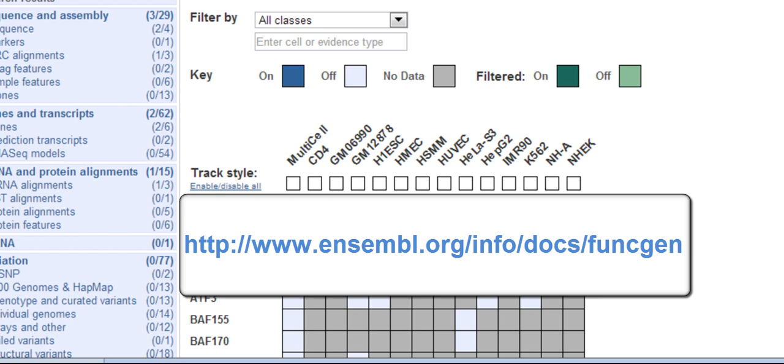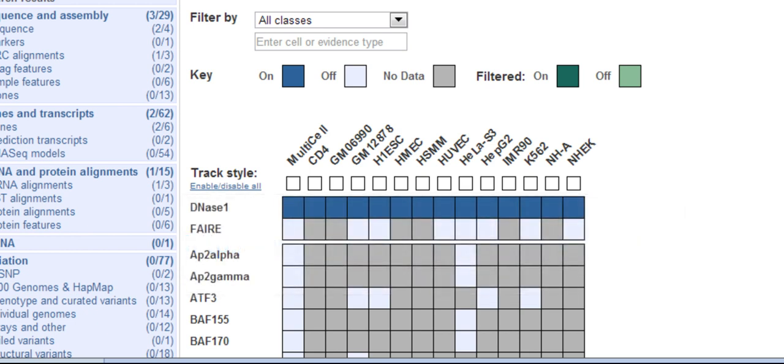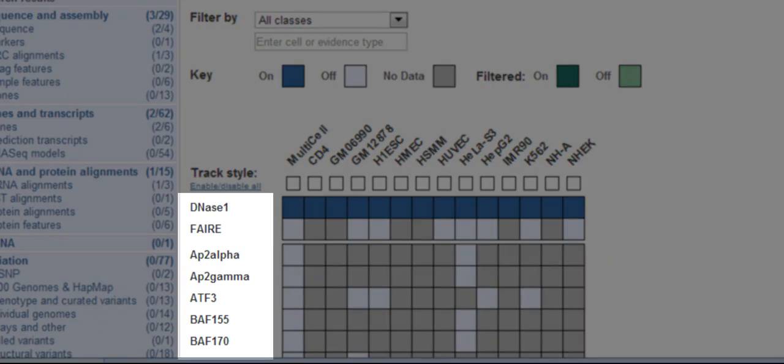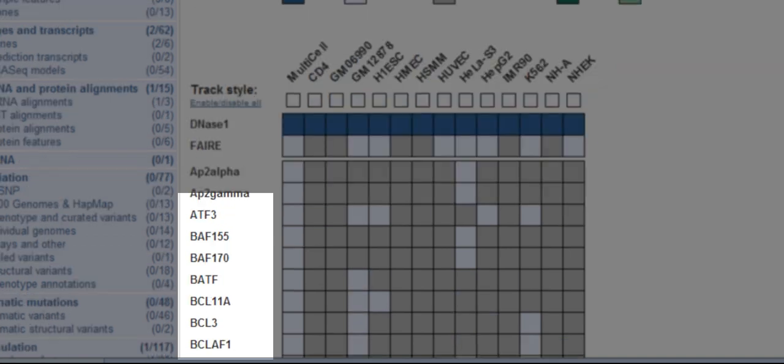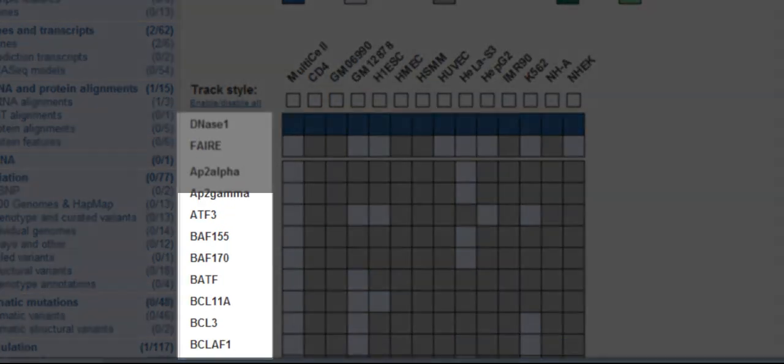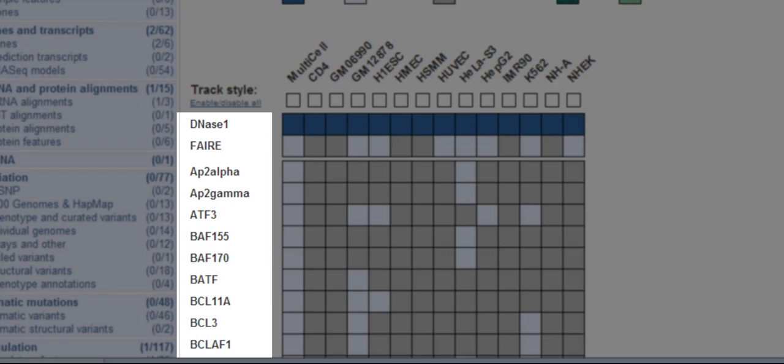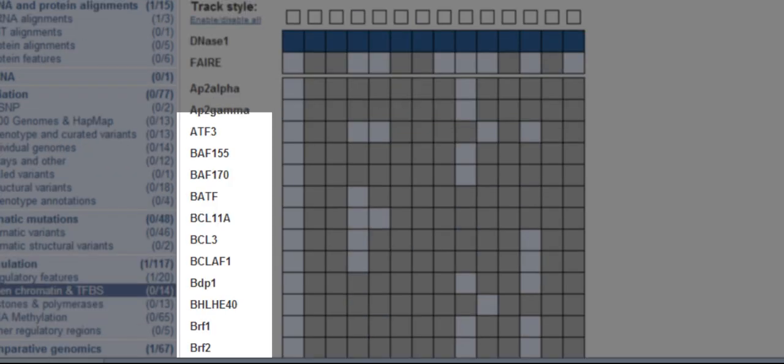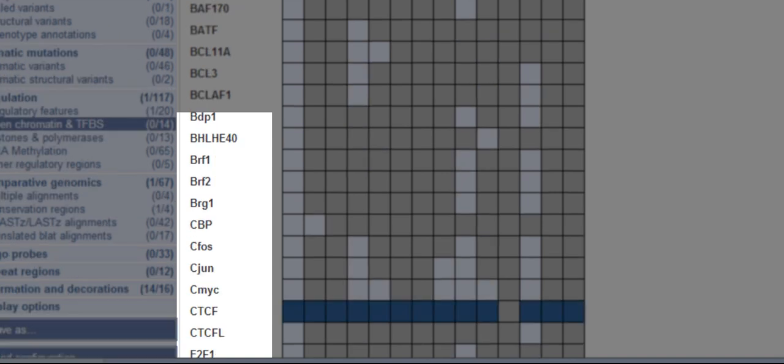I'll mention how to view the full ENCODE dataset at the end of this video. Now back to the matrix. The y-axis shows indicators of open chromatin, DNase1 hypersensitivity and FAIRE binding, and different transcription factor binding sites.